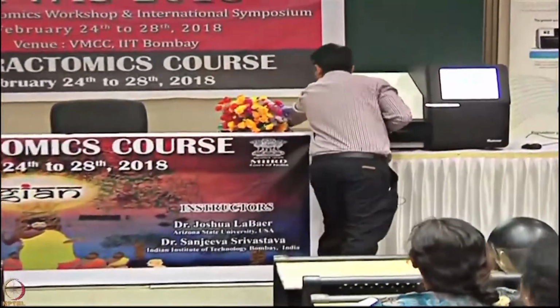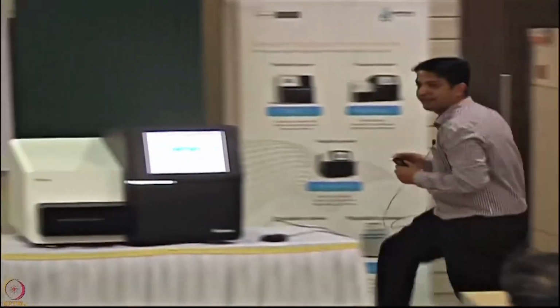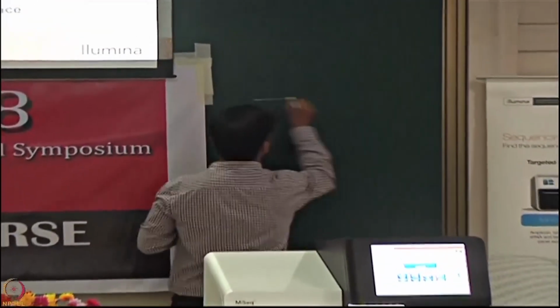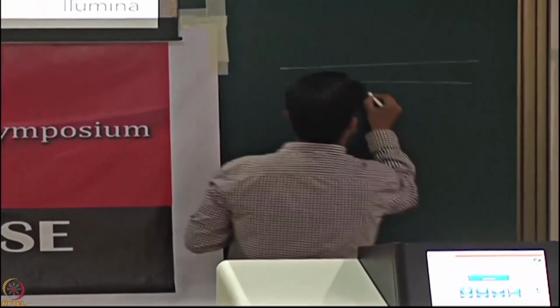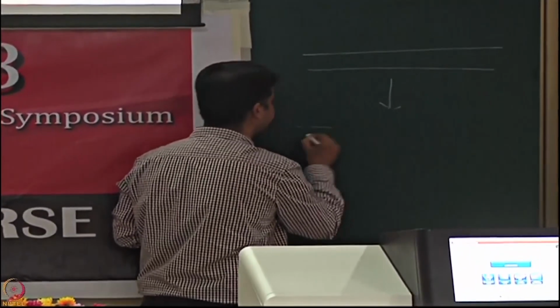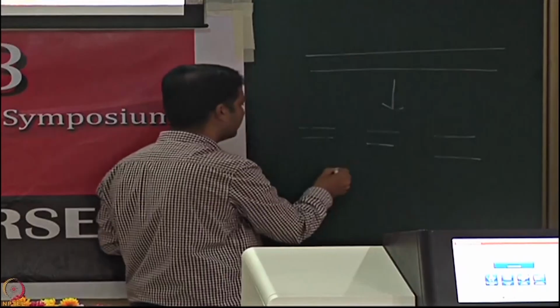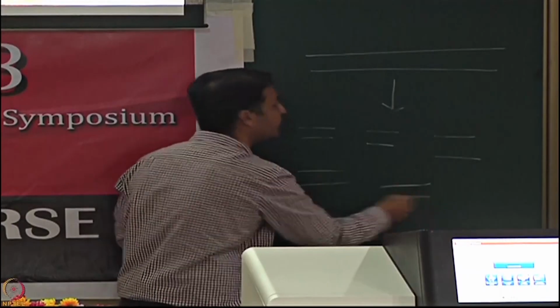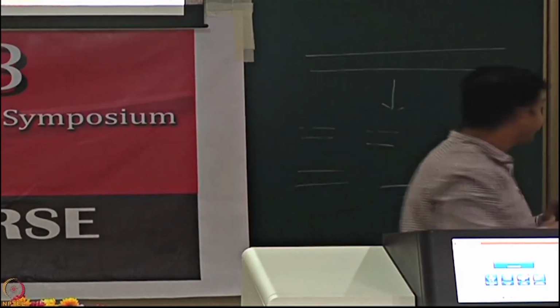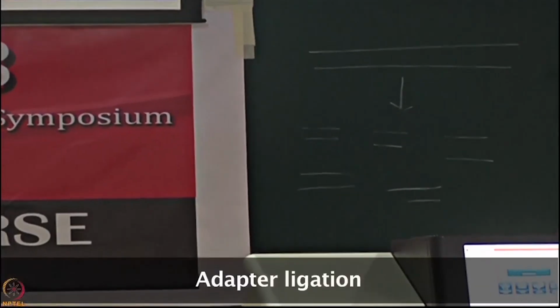Where is the chalk? Again, the same question I'm asking. Let's say this is the human genome. In Sanger, with any genome, human genome, big genes, initially the first step is we fragment it into various small fragments. Let's say human genome, so 600 base pair, we'll chop it down into millions of fragments. But these are unknown. So to get them sequenced, what do we need?